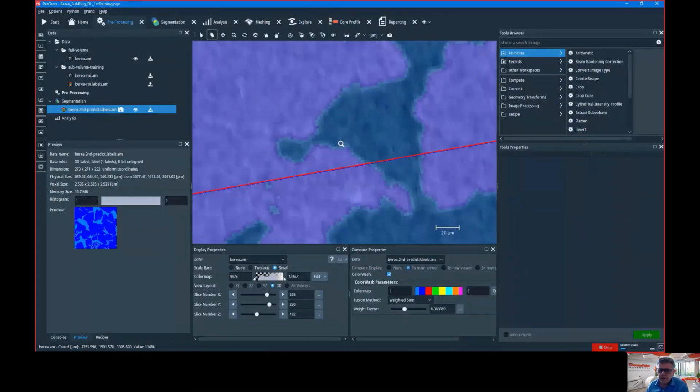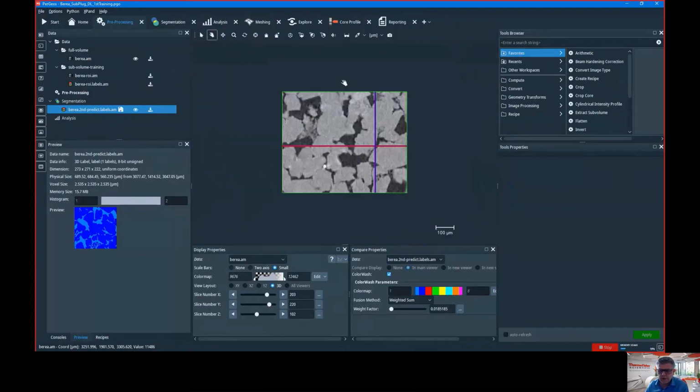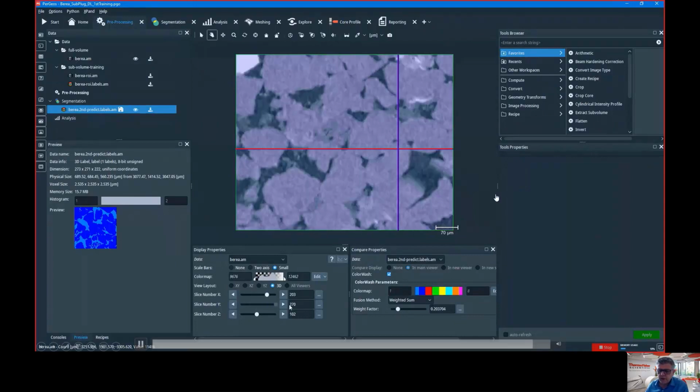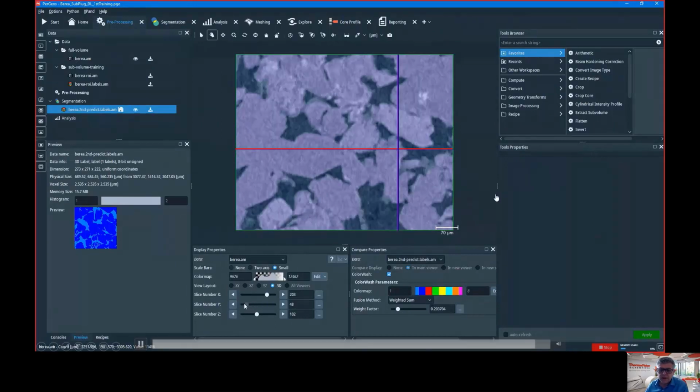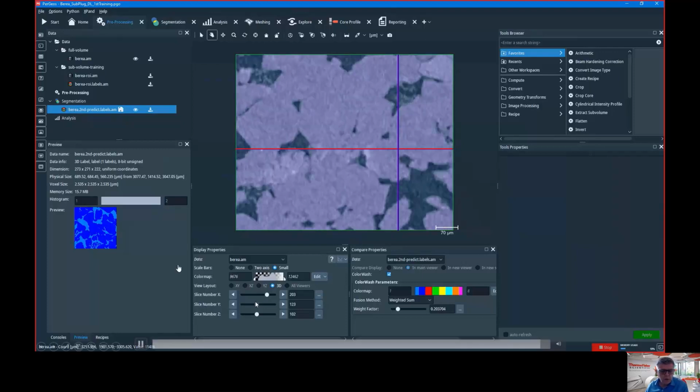It's not always the case. If you make some error in the parameters of the deep learning, you may diverge and you will not get a better result. So this is a demo. Everything works nice. Deep learning is a lot of knowledge, a lot of time. But then when it works, it's really magic. Why is it better than traditional image processing? You see the point here. I don't give any parameters. I just say, do prediction, please.